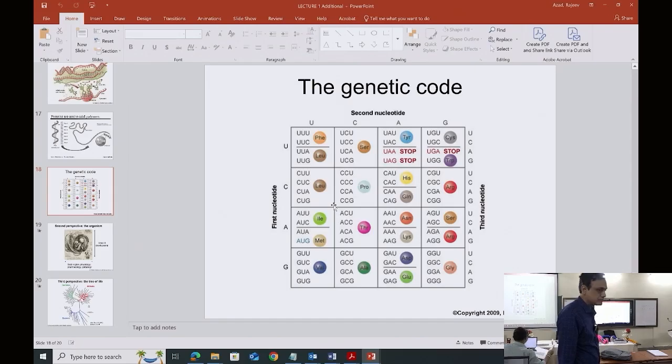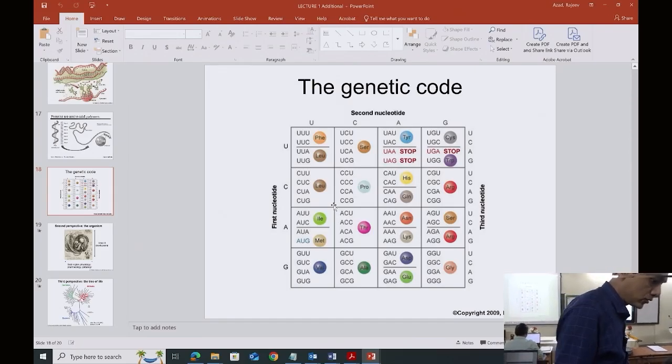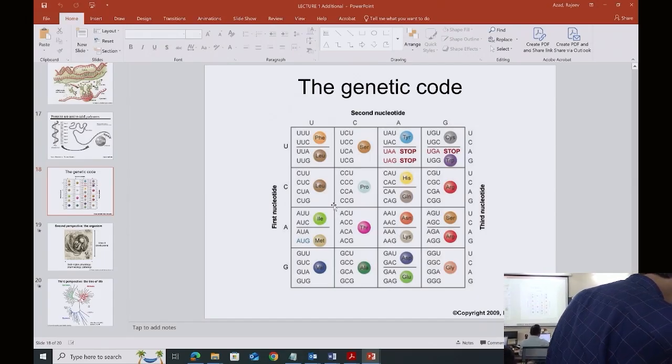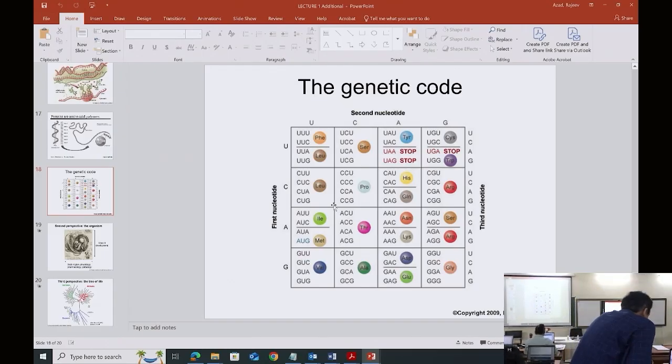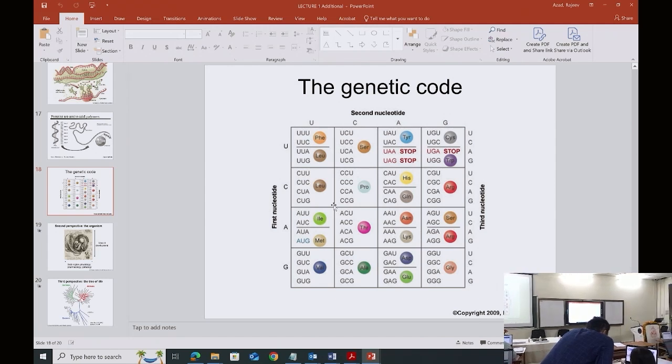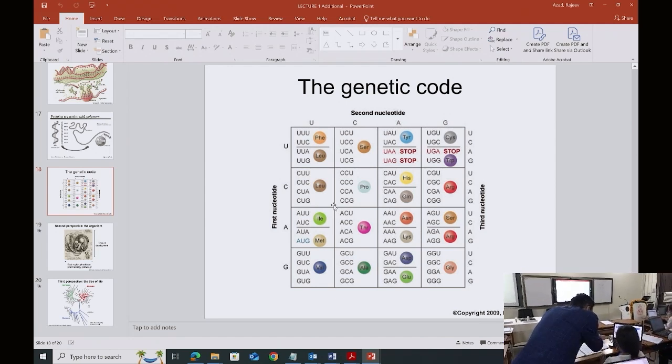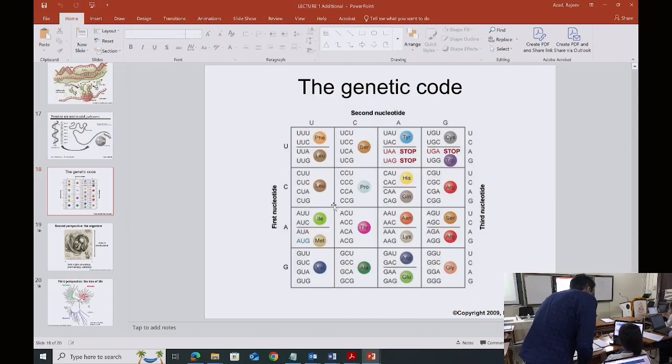So you have the last 15 nucleotides. You're downloading. Oh, you got the last 15 nucleotides? No? Downloading. So if you go back, go up. Oh, hanging. Let it download. It is not downloading. Can you go down towards the end?